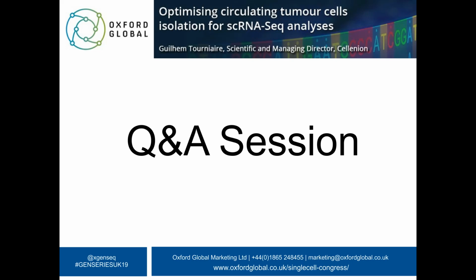Fairly straightforward. Okay, and for the two techniques you showed us, what about the index of the library? When do they dispense them before pooling? Typically in those two examples, in the example from UCSF, the 3' single cell RNA-Seq libraries, the primers are preloaded into the chip before single cell isolation, because you can prepare dozens of chips with those barcoded primers in the well and store them until the day of use. So these are very stable once they are in there.